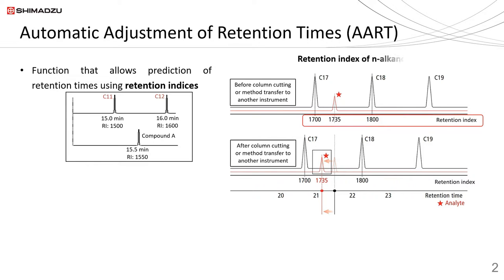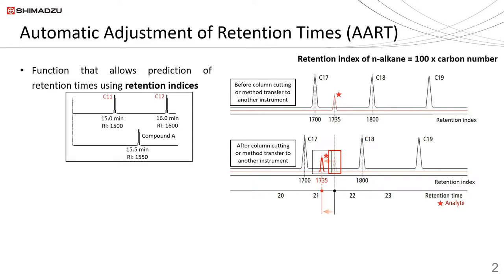The retention indices of n-alkanes are calculated by multiplying their carbon number by 100. When a column is cut during maintenance, or a method is transferred to another instrument, there may be a shift in retention times. If the shift in retention times is significant and peaks are eluting outside the quantitation window, peak identification and data processing will not be performed properly.